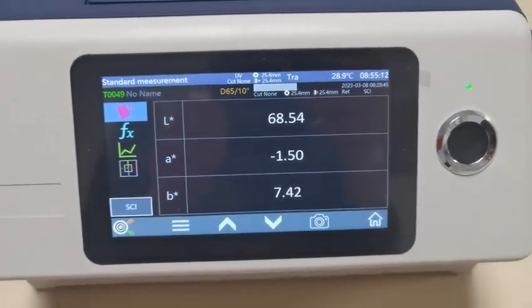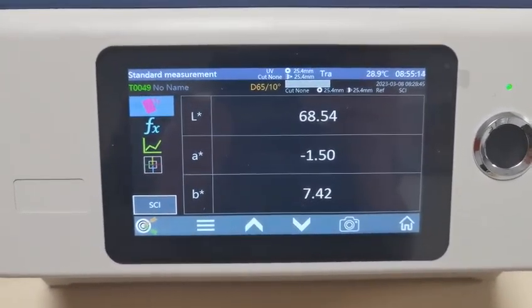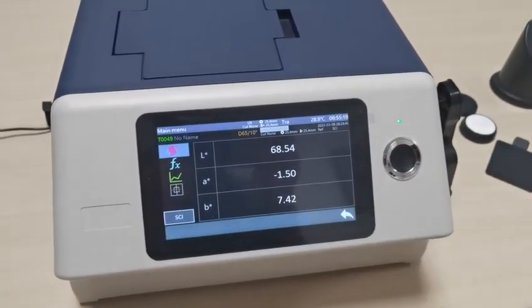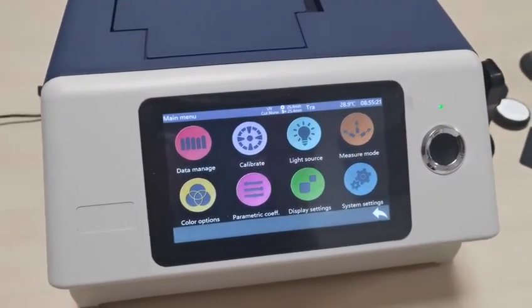This is the measuring interface. First, we need to calibrate. Return to the main menu, and then press calibrate.